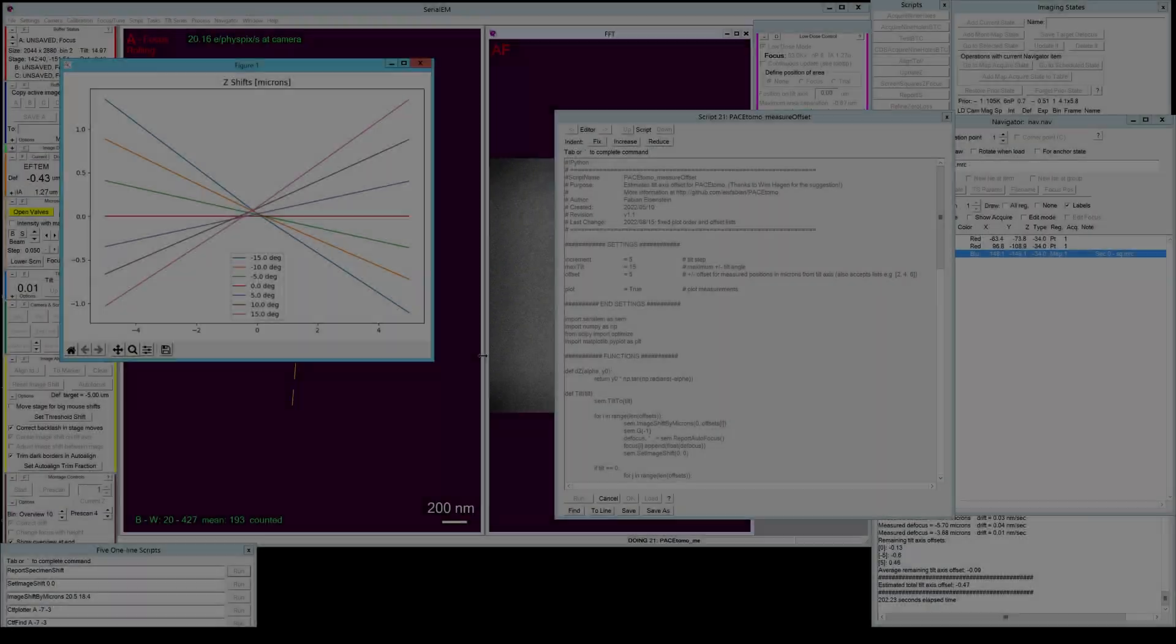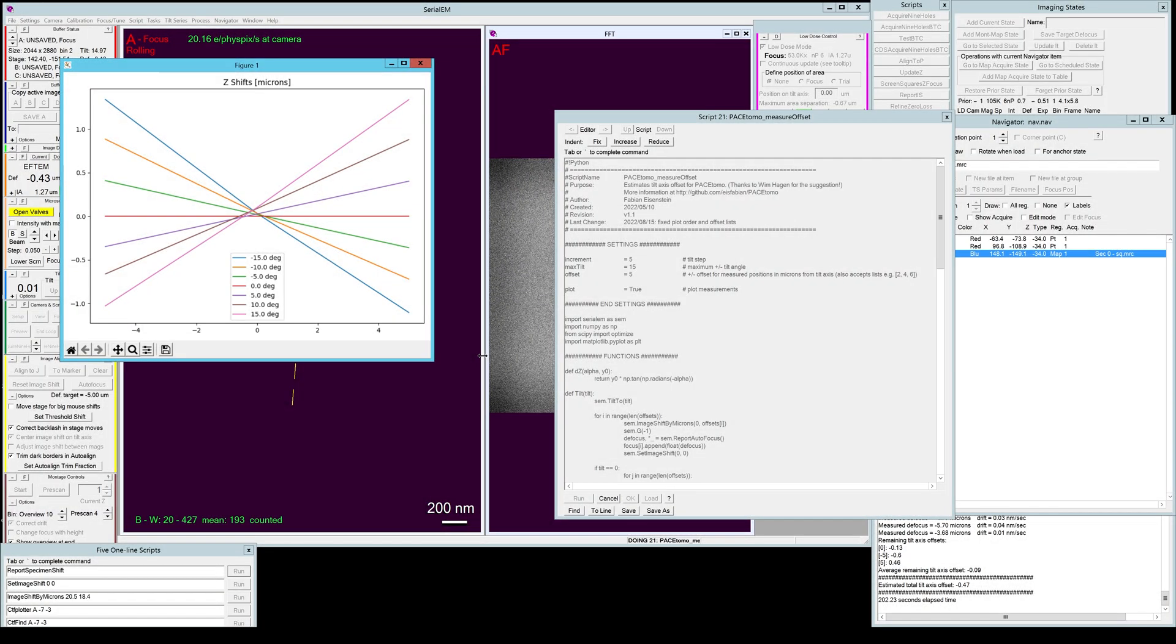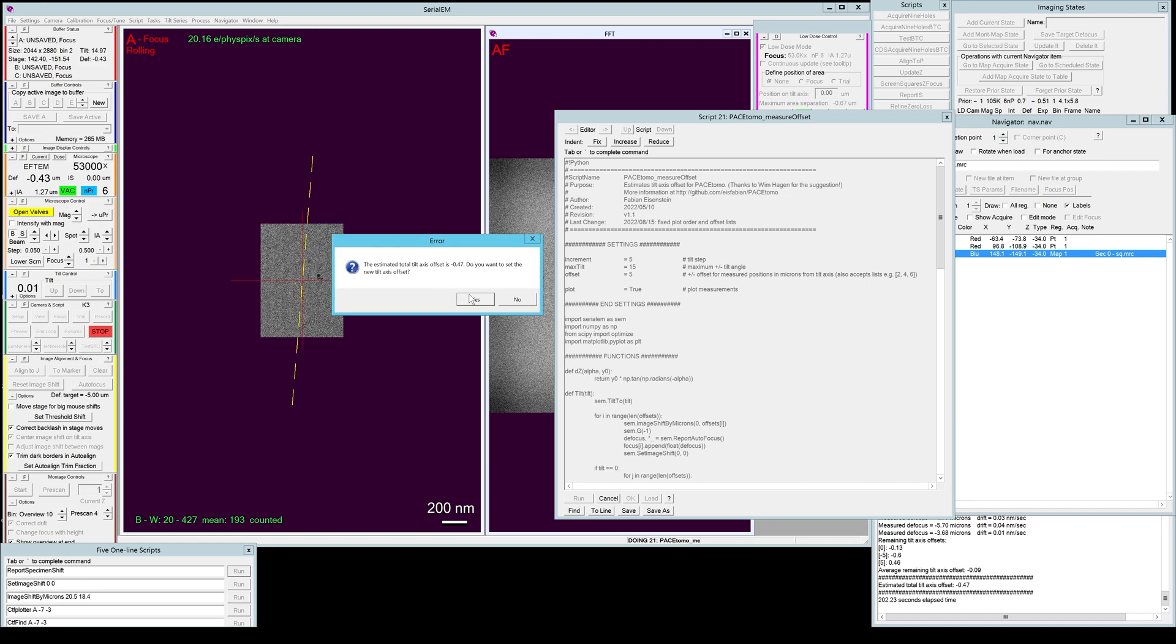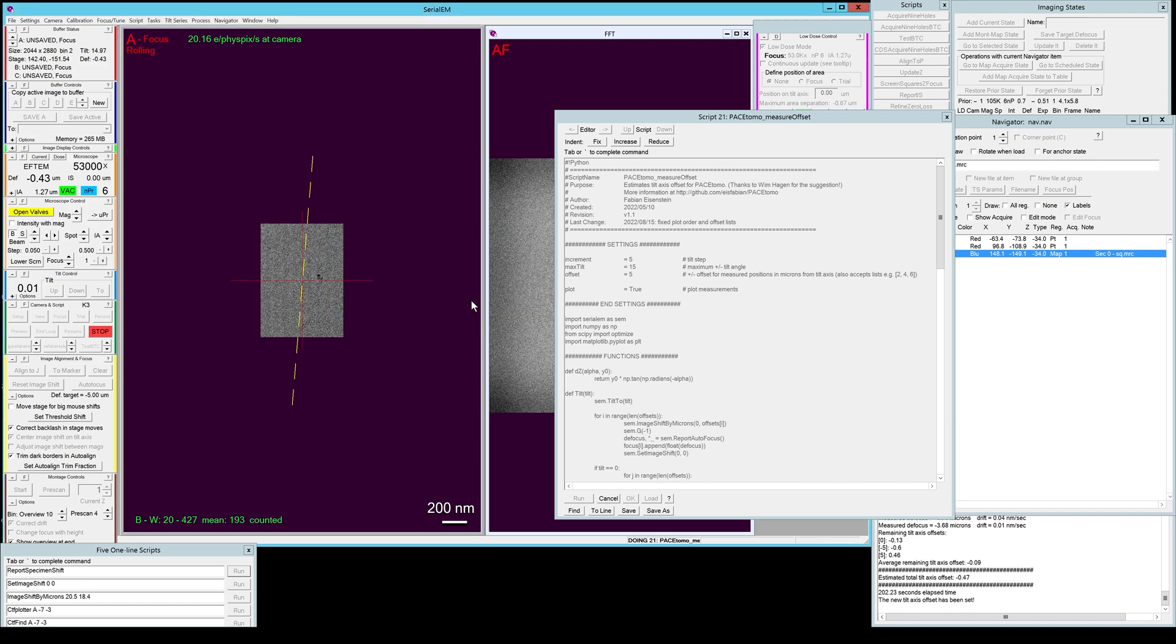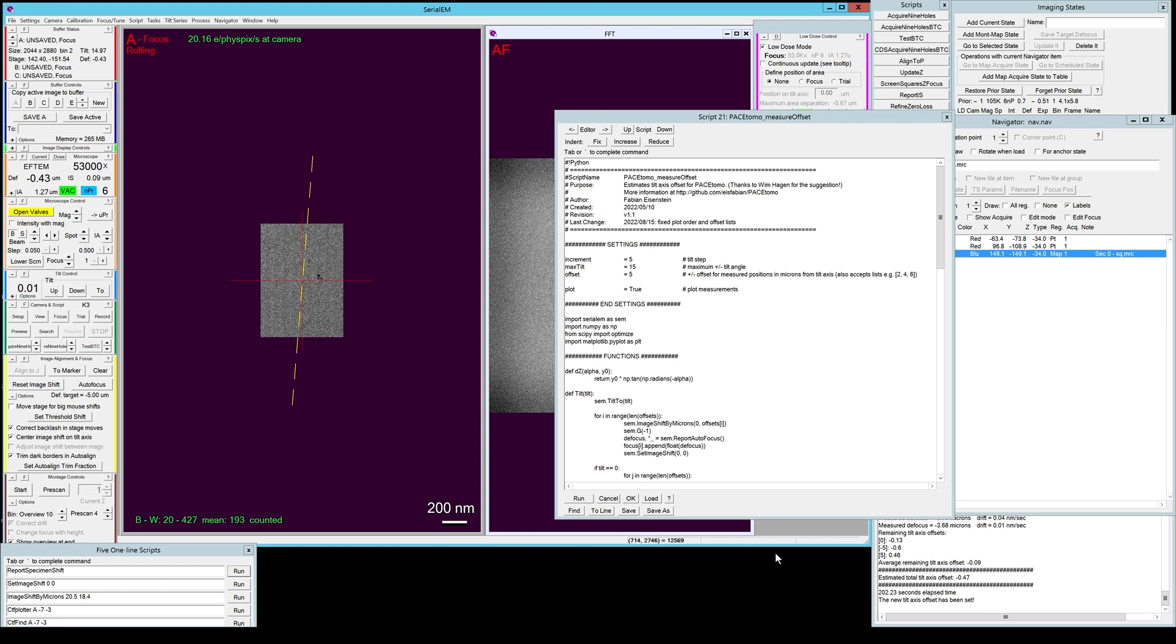And here we go, you can see now the remaining tilt axis offset is only about 0.1, and we can once again apply this offset. But it will vary about plus minus 0.1 every time you run, so that's a pretty good estimate. And that concludes the setup, everything you need to do before you actually start setting up your PACE TOMO targets.